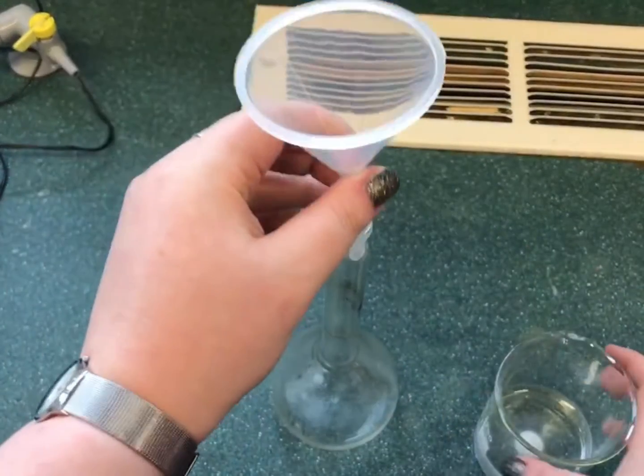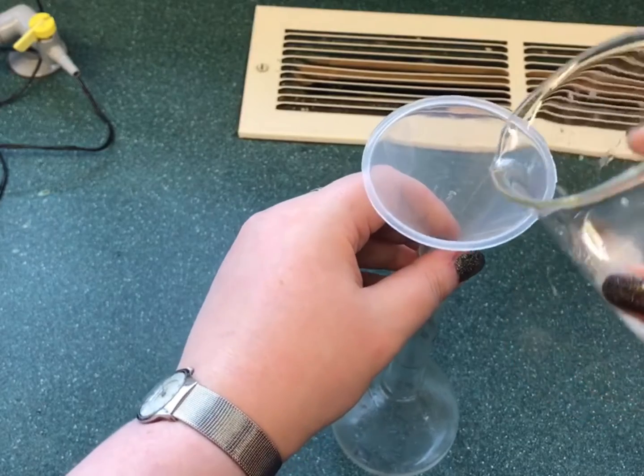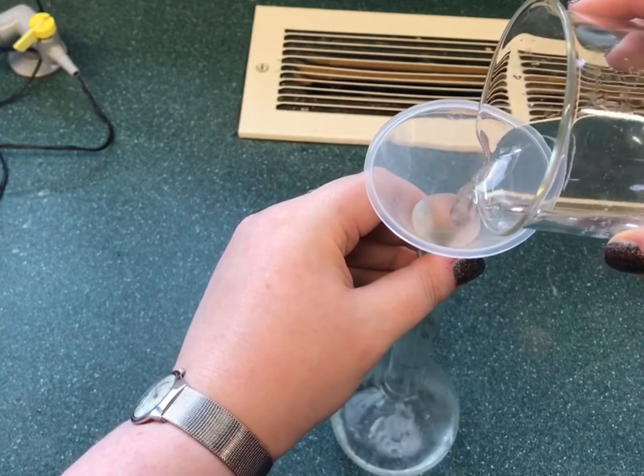Once dissolved, the solution is transferred to the standard flask. The beaker, and if a glass rod was used to stir, are rinsed and the washings are transferred to the standard flask.